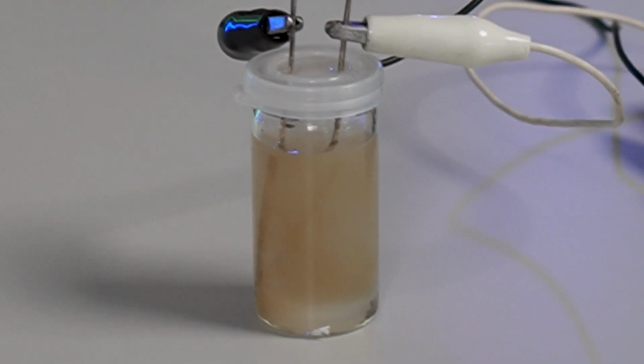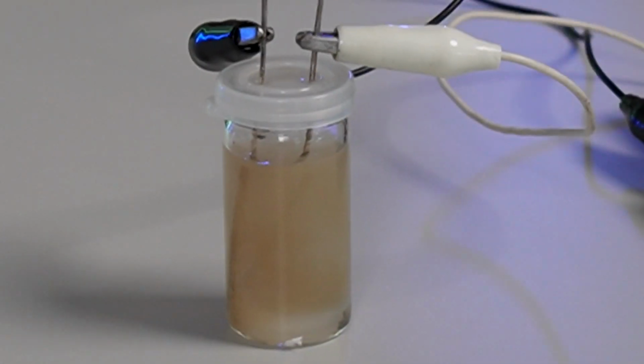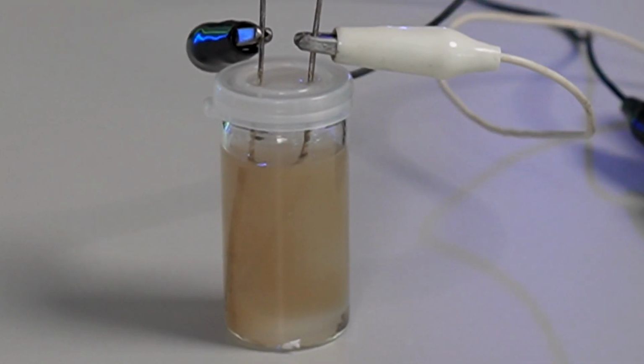Now that I'm looking at it, it's gotten quite brown and murky. There's still probably some gas being generated from one of the electrodes. From the other electrode, it looks like something's peeling off slowly, and it gets more and more murky as we speak.